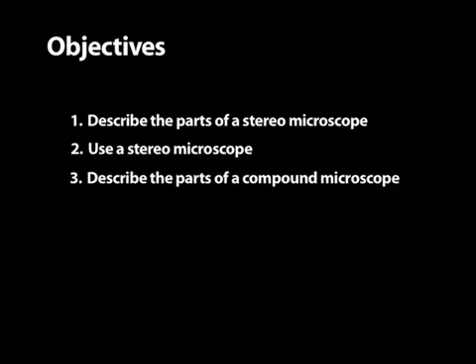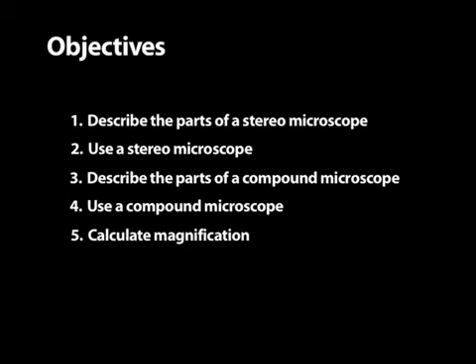3. Identify and describe the functions of the basic parts of a compound microscope. 4. Set up, adjust, and use a compound microscope, including oil immersion. 5. Calculate the magnification capabilities of a microscope. And 6. Estimate the size of microscopic objects.